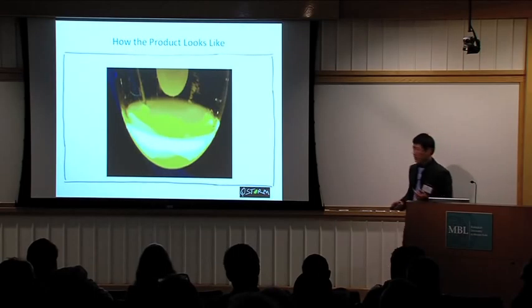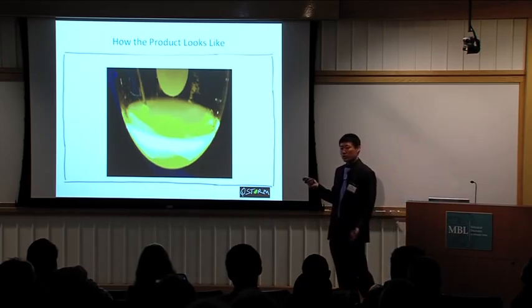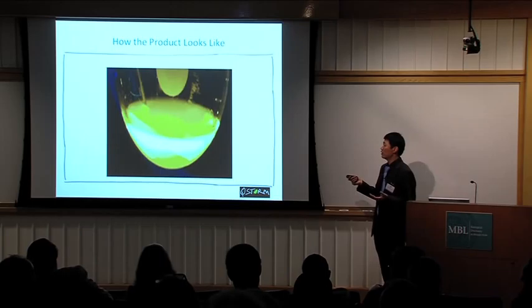Since we are applying this ligand here, we can slow down the nucleation step significantly. So even after 1 hour, we still just get the crystal nucleus. Then in the second step, we inject a zinc salt into the solution and slowly grow the crystal. And if we maintain this temperature at about 260 degrees Celsius, we can very precisely control the size of the crystal.